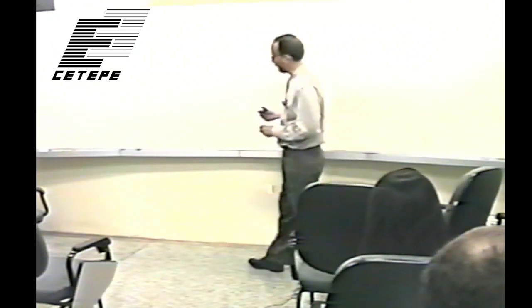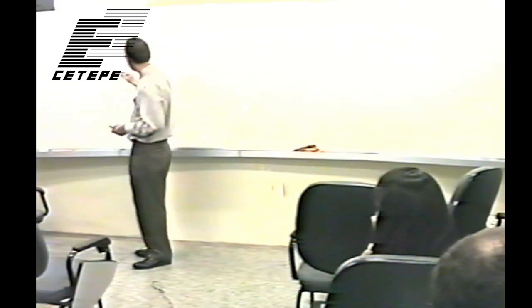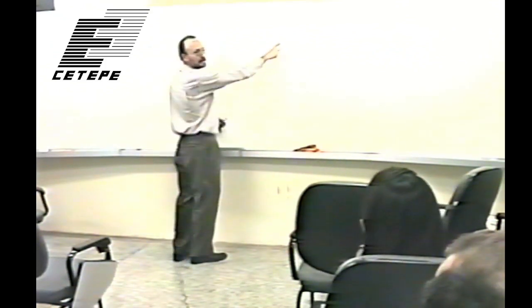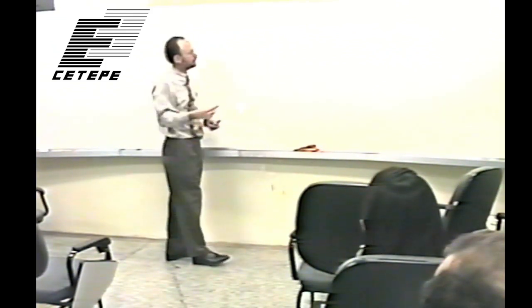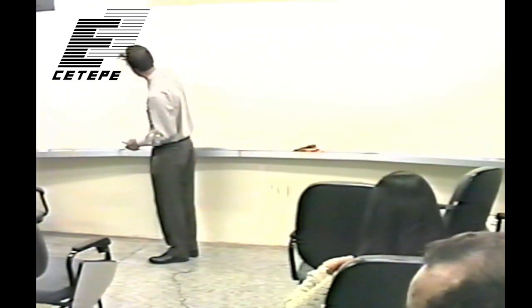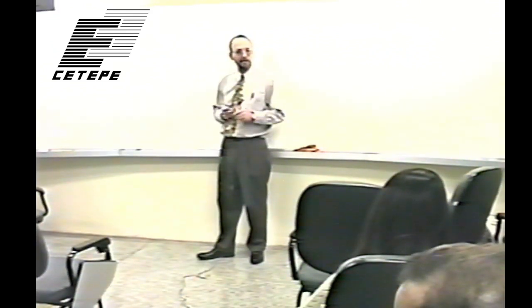But what you might want to do then is look in the periodic table, and I have a slide that illustrates this, but it's easy to look in the periodic table or listing of these K edges, and you'd like to find another element to use in your filter that had a K edge just lower than the K edge of iodine, okay? And so then it would be even better than what I just described, which was just subtracting an image taken with this iodine filter from one taken without it. You'd get an even better image if you were able to take an image with this iodine filter and then one with a different filter whose K edge was just below here, okay? So that would even enhance the difference more.